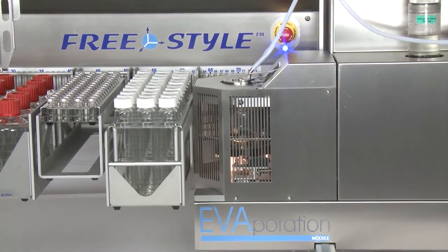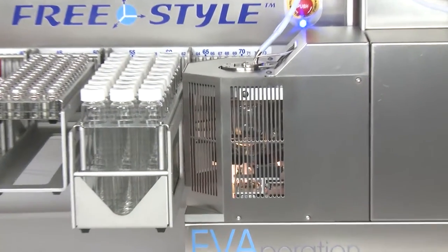In this video we shall demonstrate the freestyle basic with the evaporation module.